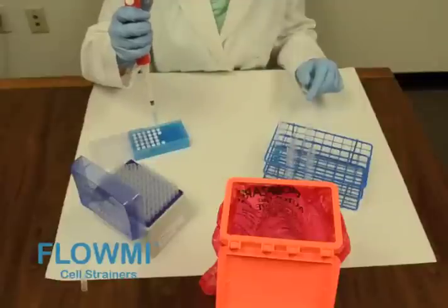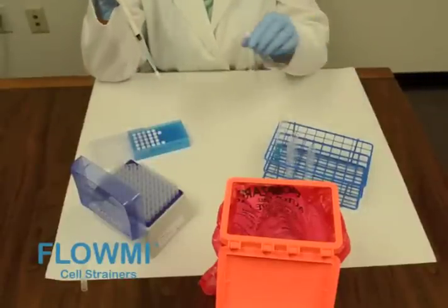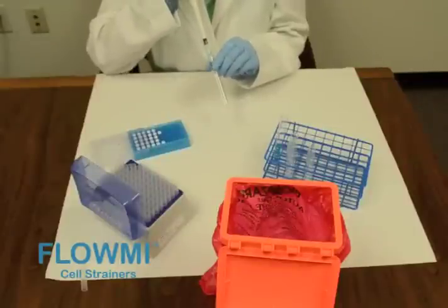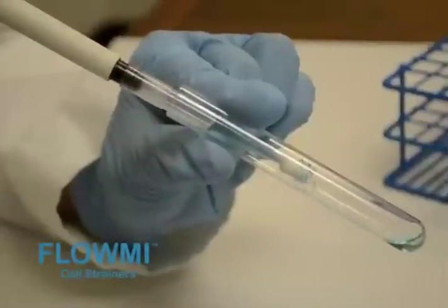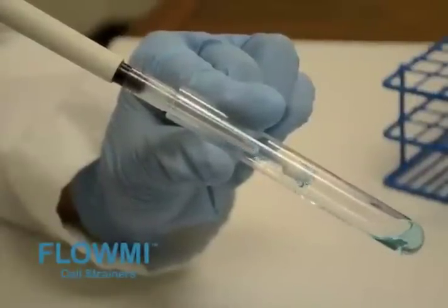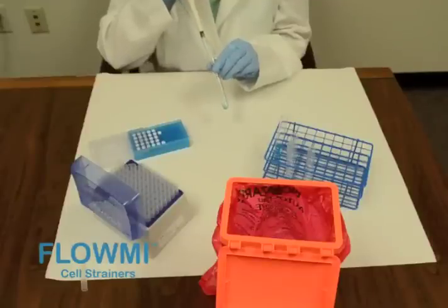Then simply push the pipette tip into one of the Flomi cell strainers and press down to secure the joining of the tip to the filter. Position the pipette tip over a suitable receptacle and depress the plunger to dispense the liquid from the pipette tip through the 40 micron cell strainer and into the receptacle.